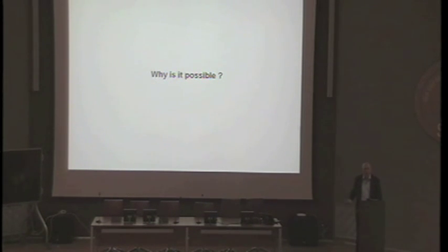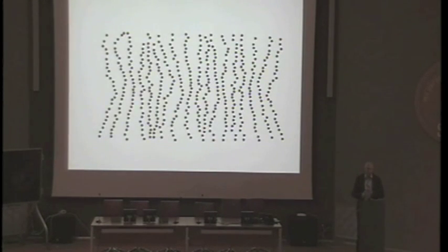And many of you will know that this field, now called super resolution microscopy, is developing very quickly. All the new methods are coming up with new acronyms and so on, and you don't know how this relates, how this compares. If you understand how it works, what really the gist of the whole story is, then you can put it in perspective, and then you can understand how you can make use of it. Of course, trying to explain how it works, I'm going to be very primitive in the way I'm explaining it. And it is very simple. You can explain it, I think, to everyone who has a basic understanding of natural sciences.